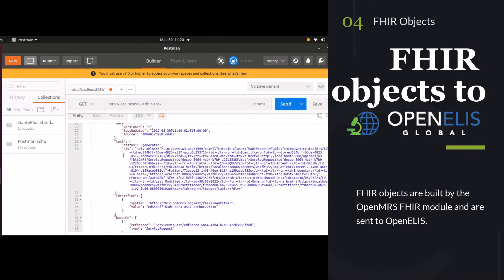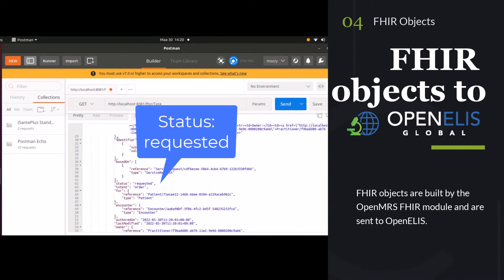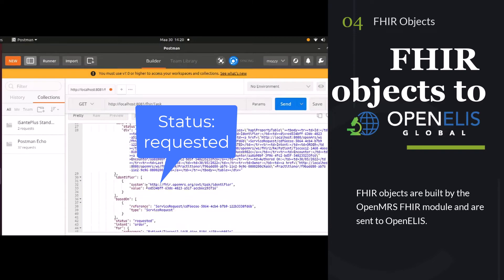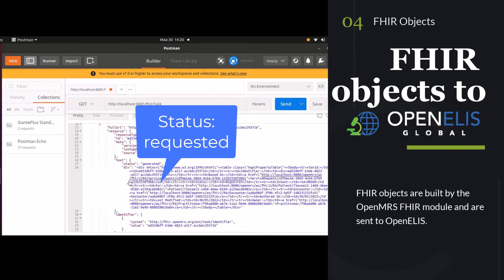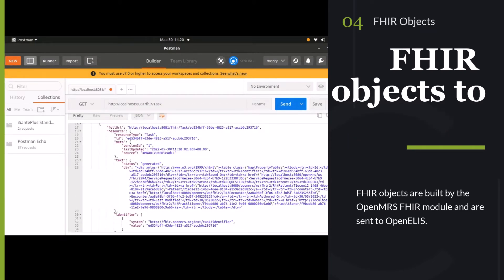So it sends a bundle of FHIR objects, and you can see here one of our main FHIR objects, the task request, has now gone to requested status and is ready for OpenELIS to pick up.